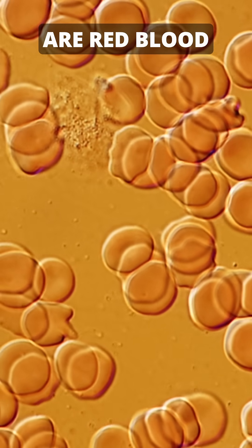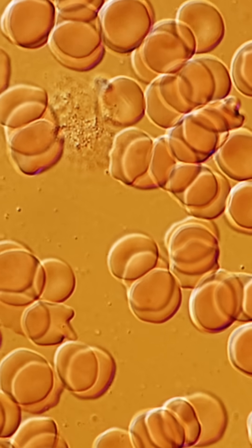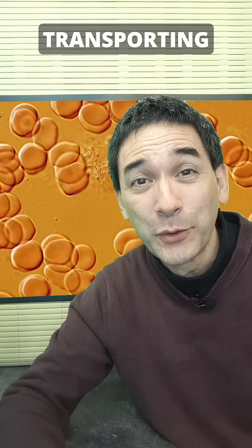These here are red blood cells under the microscope. They look totally healthy. They're round and disc-shaped, and they're transporting oxygen right now.